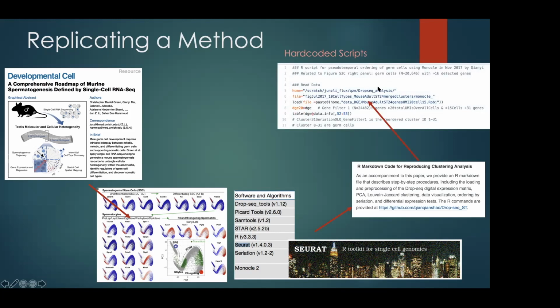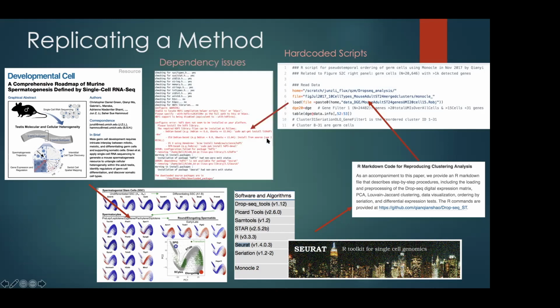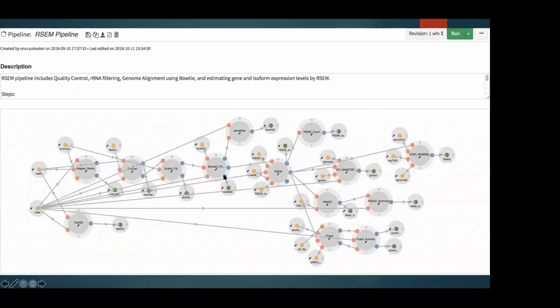So you have to change lots of things in their code. This is just an example, but even the versions are not going to work for you. So this is useless. Even though these are great people, whatever they deposit here is almost useless. You have to redo everything yourself. When you try to install, you get lots of errors that it's not installable.